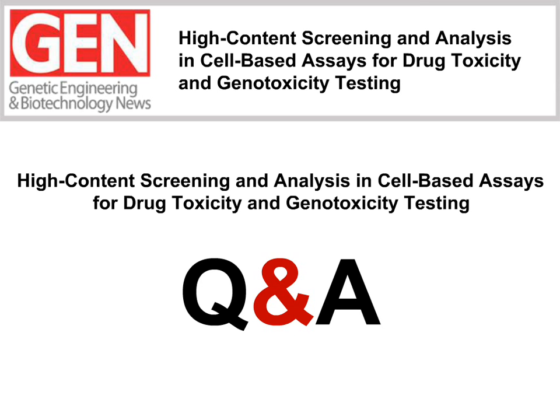And the amount of time needed to measure one 96 well plate or one 384 well plate in our assay depends on the magnification we're using and the number of fields we're imaging. In the particular assay I talked about, it takes about 50 minutes to an hour to image a plate, but that's 3 channels and 12 fields of view per well, so we're getting quite a lot of data from that.